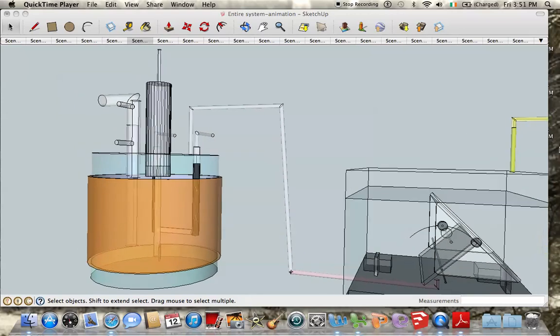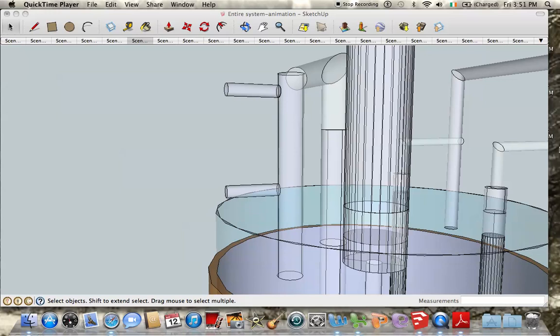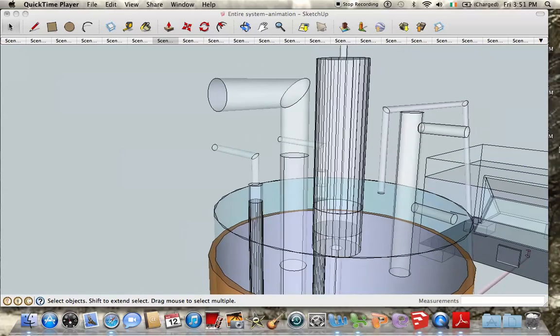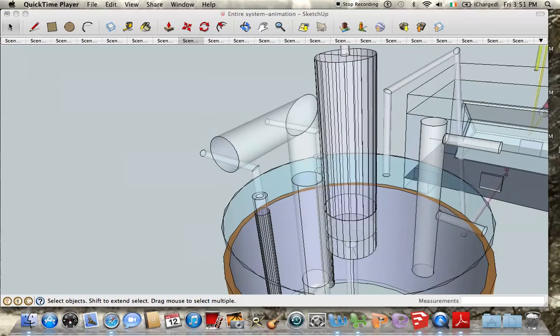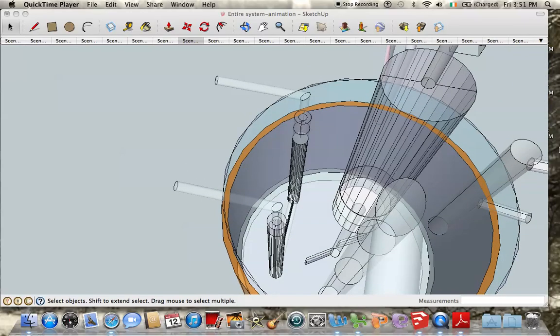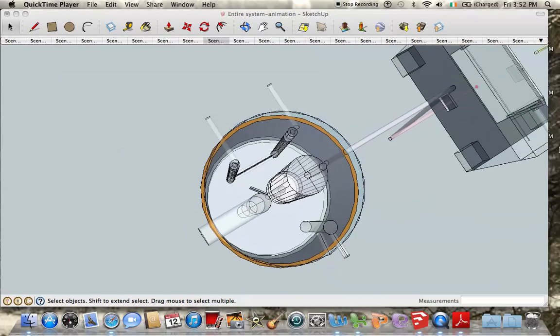As we zoom in on the anaerobic digester, we see a condenser. This is to cool down the anaerobic digestion process if necessary. The two pipes protruding from the cylinder are connected to an external control. All of the pipes here are connected to an external control. This is a nitrogen flusher which flushes nitrogen through the system before the anaerobic digestion takes place in order to ensure that no oxygen is in the system, hence anaerobic. Here we can see hot water input and water output, again for temperature control.